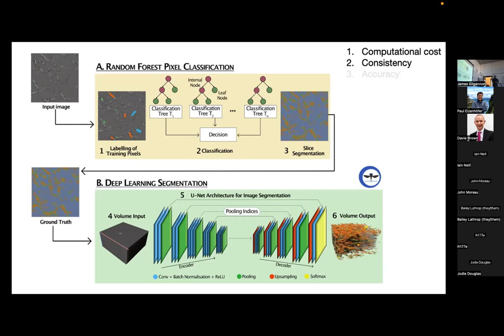But that gives us consistency because we can apply this across all our data sets. So when we report or try and understand how good a job our segmentation did, it's really the same process. It's not thresholds that change because you had a slightly different acquisition moment. It's very consistent. I can't oversell that enough. If you have a chance to play around with deep learning on problems like this, and you have data sets big enough to justify it, it's a total game changer. We can just give this to the new PhD student and they can process everything again. For a changed reaction, they can spend maybe a month or so refining this step for the new system and then use it for everything. So it's definitely time well spent.